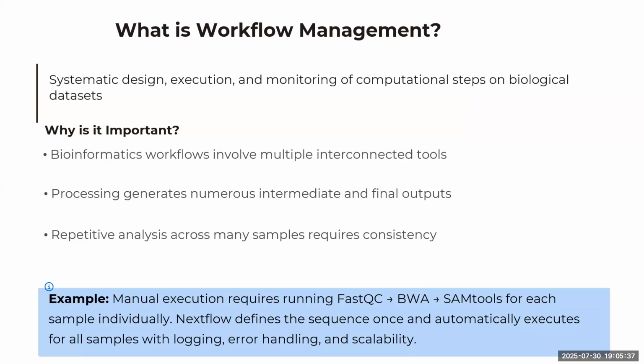When we talk about bioinformatics, we are dealing with complex multi-step analysis, involving huge data and numerous tools. We can think of a situation where we want to process thousands of files, particularly FASTQ files, all together. We have to perform quality control, then alignment, and then quantification.